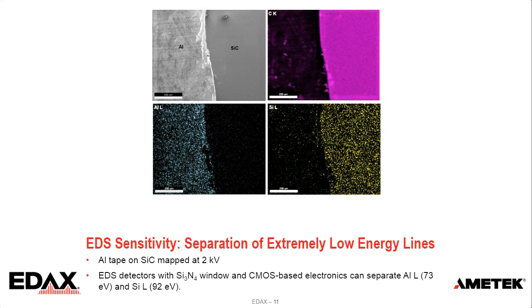We see the EDS detectors with silicon nitride windows have very good X-ray transmission in the extremely low energy range, so it can separate the aluminum line, which is 73 eV, and the silicon line, which is 92 eV. And we also have a very strong carbon signal in the map.